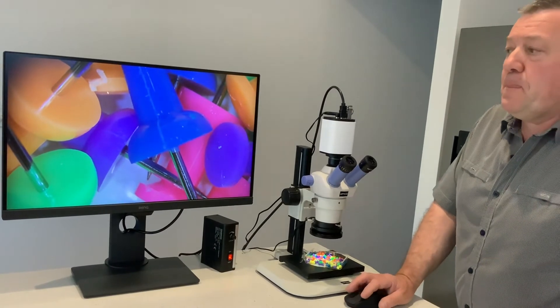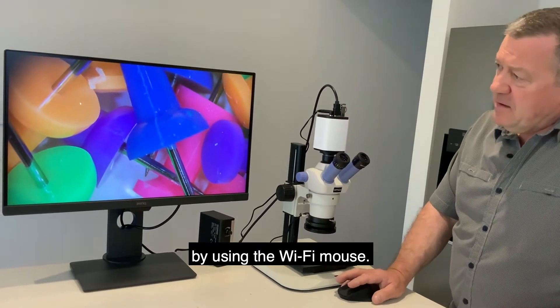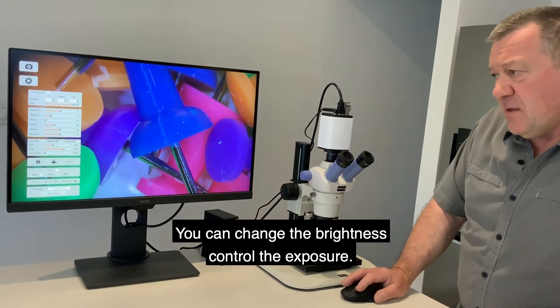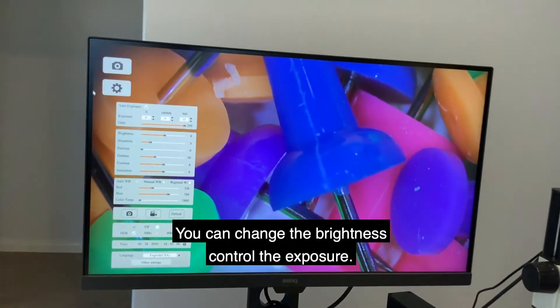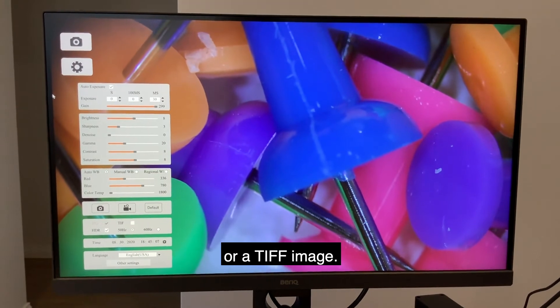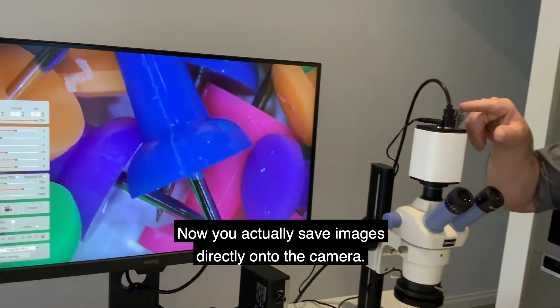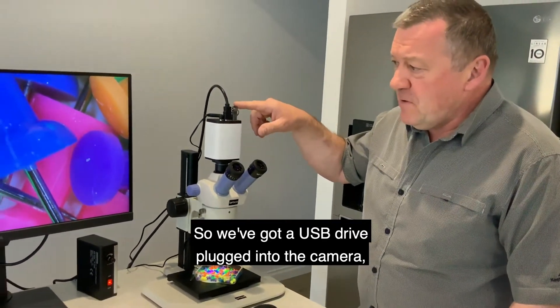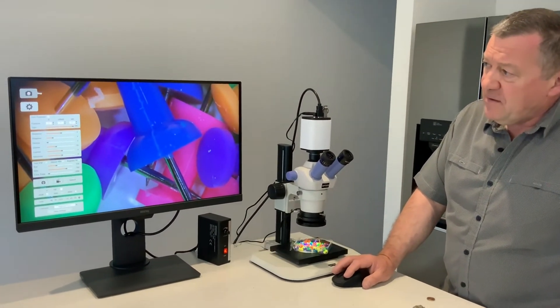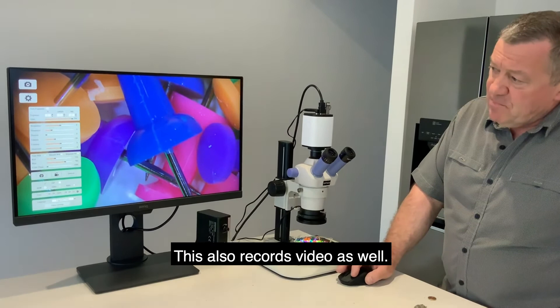You can adjust the software settings by using the WiFi mouse. Going to settings, you can change the brightness, control the exposure, and choose whether you want to save as a JPEG or a TIFF image. You save images directly onto the camera — we've got a USB drive plugged into the camera and you save images direct to the USB drive. Simply click the camera icon to take a photograph, and you can also record video as well.